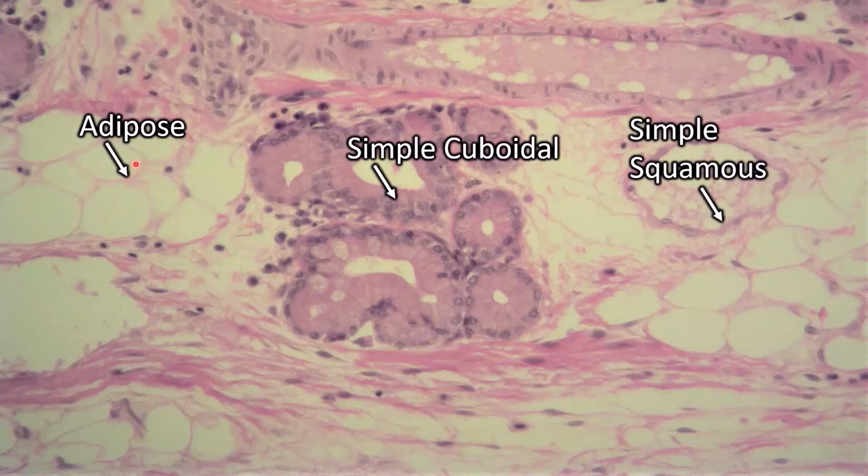So this is not epithelium. I just wanted to include it. It's adipose. Most people know that one.